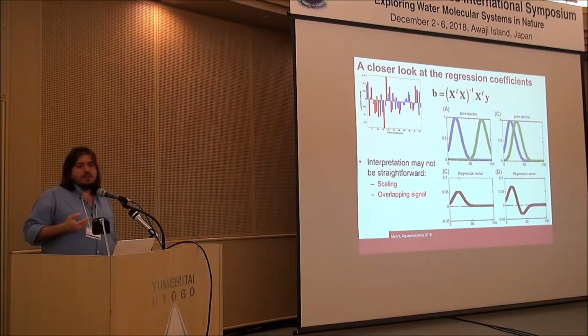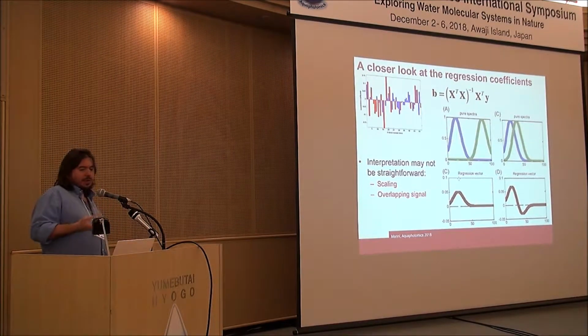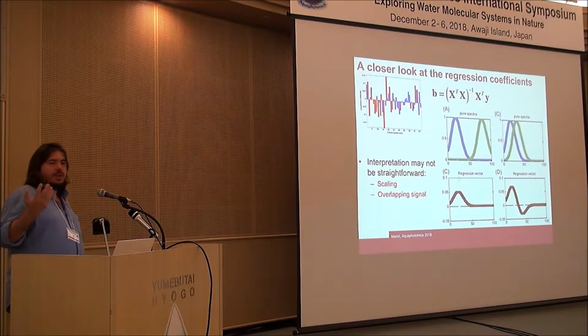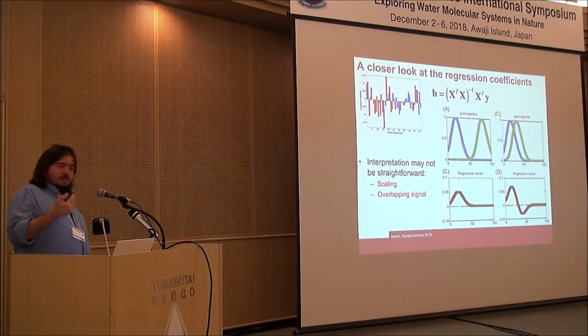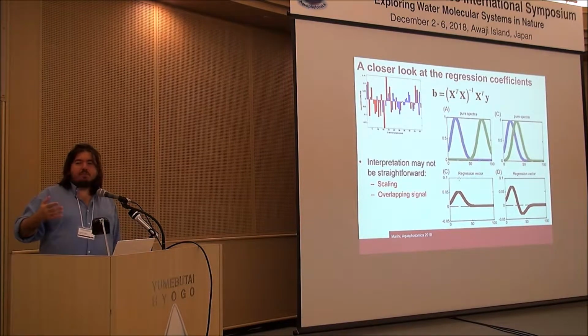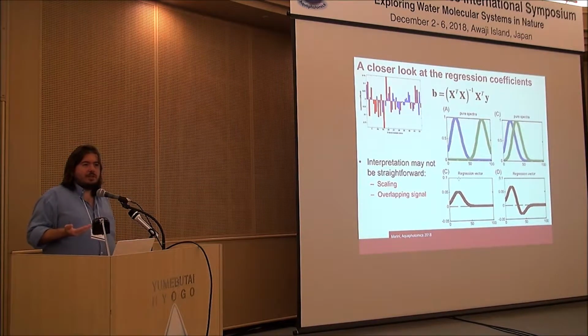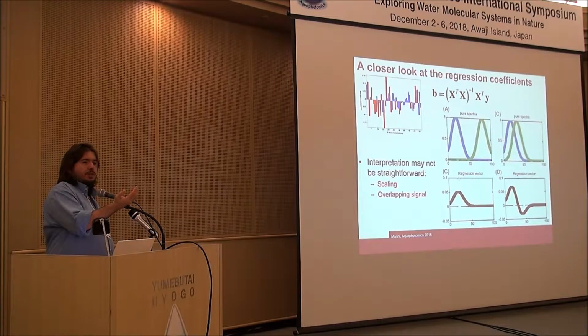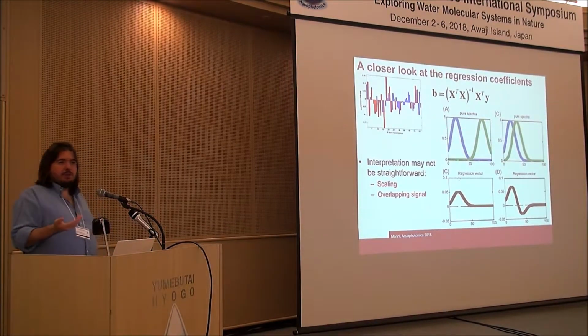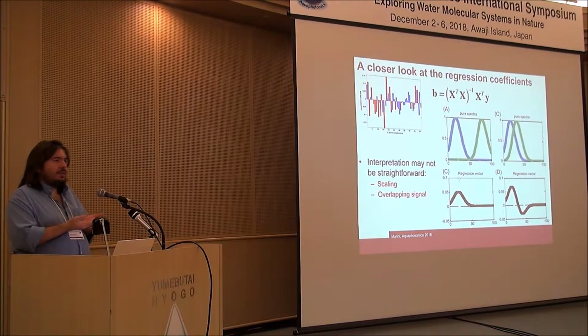Also because, and this has been reported already in the beginning of the 90s, it's true for all kinds of regression methods, especially when they are calculated on data having possibly overlapping profiles. In the case of overlapping profiles, regression coefficients, of course, do not match the pure spectra of the constituent, but they have to take into account all the orthogonalization with respect to the interfering phenomena.